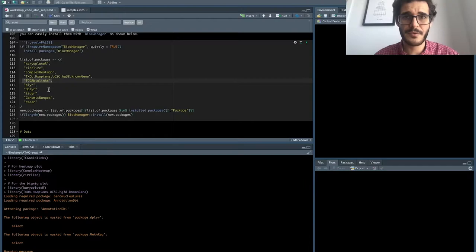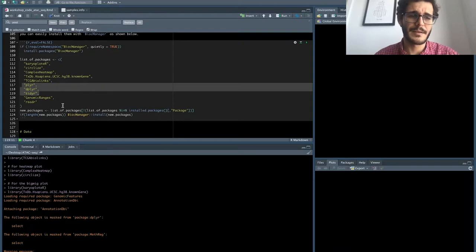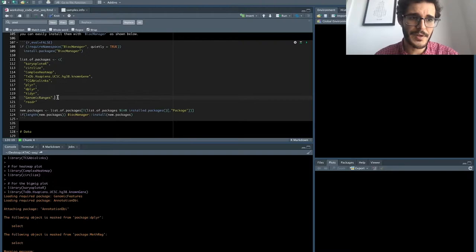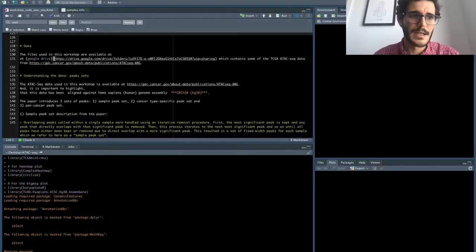Going through the libraries: ComplexHeatmap is used for the heatmap plotting and circlize also. TCGAbiolinks we're going to use to gather metadata information from those samples. purrr and dplyr are mainly for doing loops or handling the data. GenomicRanges will be used to look for overlapping between regions.